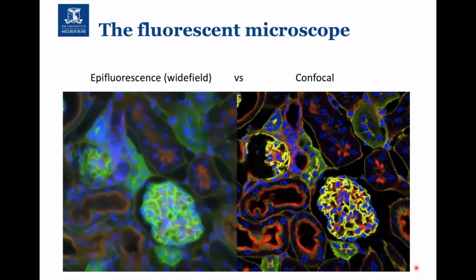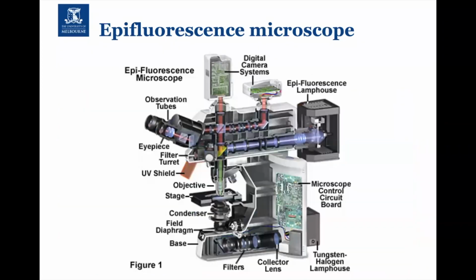And what I thought would be useful for you to understand how these microscopes work is if we go through the structure of the microscope. So this is taken from a very good microscopy education webpage, but it's a very, very complex overview of what happens within your microscopes. But yeah, probably good for you guys to understand that there's a lot going on behind that eyepiece that you're looking in.